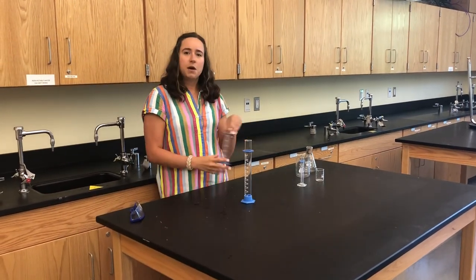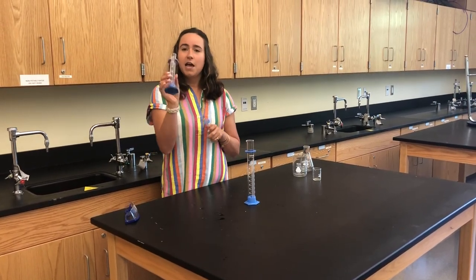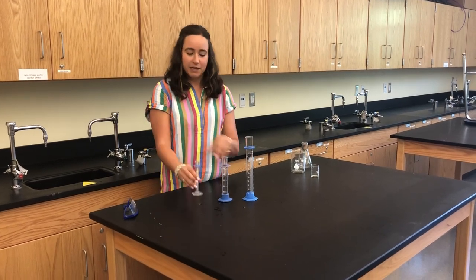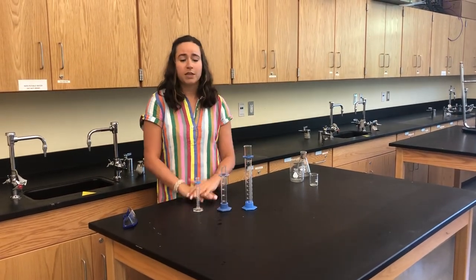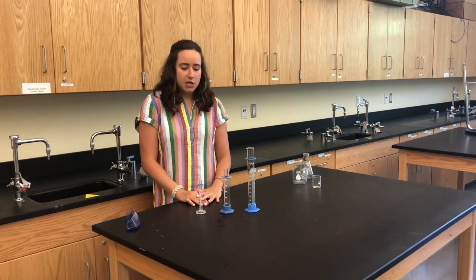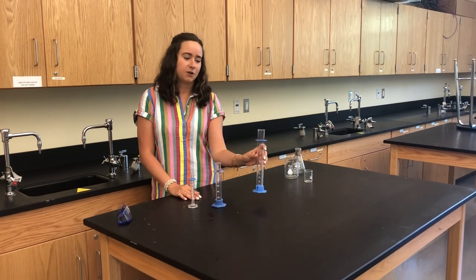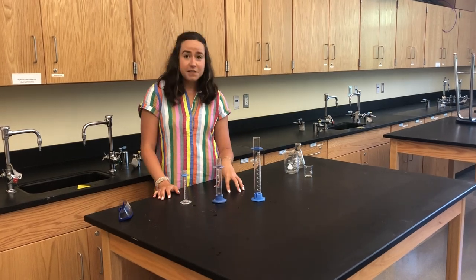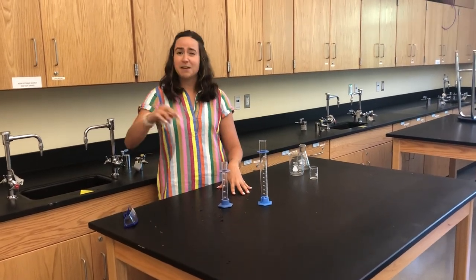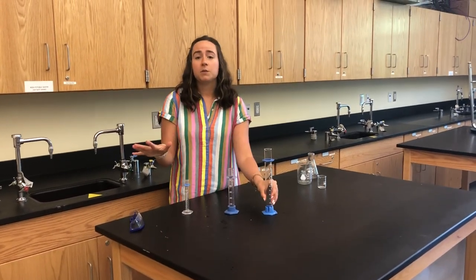Graduated cylinders come in multiple sizes for convenience. We have a 100 milliliter, a 50 milliliter, and a 10 milliliter graduated cylinder to choose from. Depending on the amount of liquid you're measuring, you choose the one that best suits your needs — if you're measuring out 5 milliliters of water, you'd use the 10 milliliter one, and if you need 50 milliliters, you wouldn't use the 10 milliliter one and measure things out five times; you'd just use the bigger one.